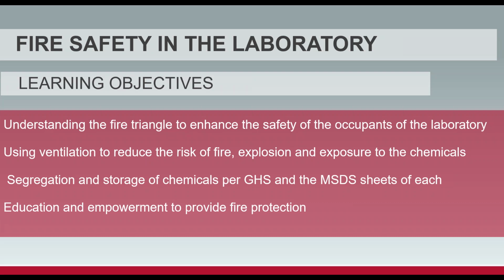I have a biology and chemistry degree. As I started out working in the laboratories, my number one focus was doing my process and expecting everything around me to support that. So I know you all design amazing spaces with safety in mind, but how do we keep that simpler for the researcher? I'm going to talk about ventilation again, to reduce the risk of fire, explosion, and exposure to chemicals. It's a three-part savior for us, that ventilation. Ultimately, there's segregation and storage of chemicals per the GHS, which I'll define for you in a couple of slides.